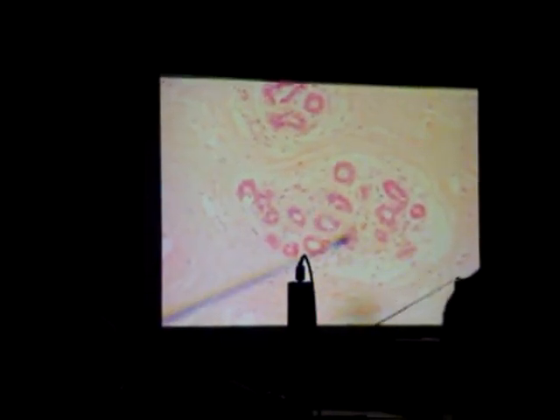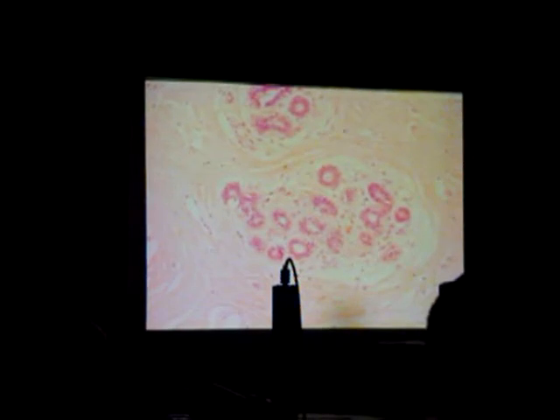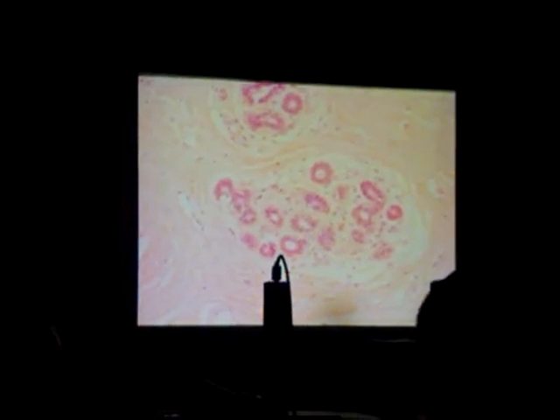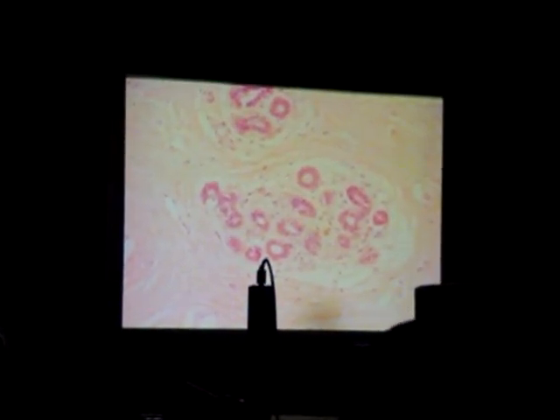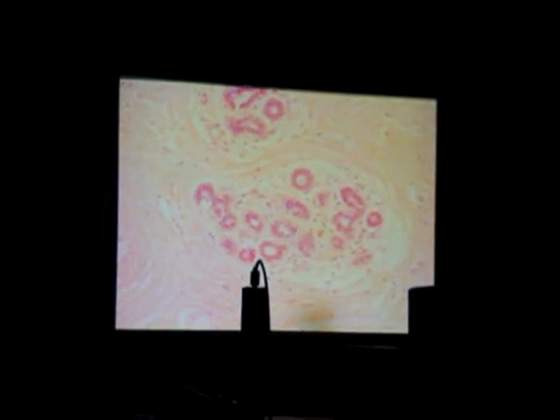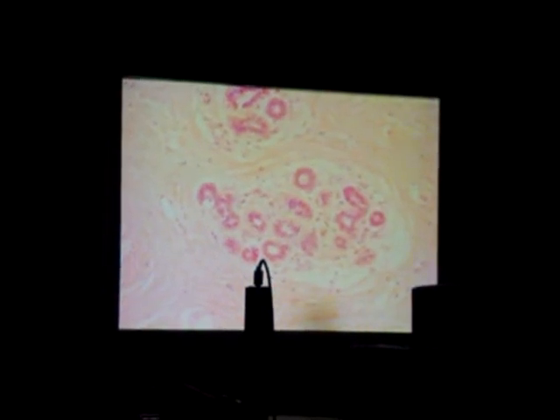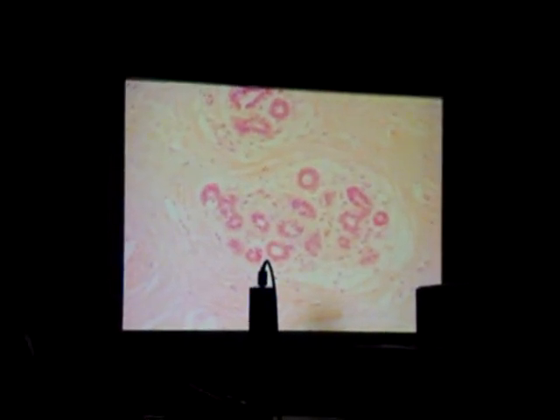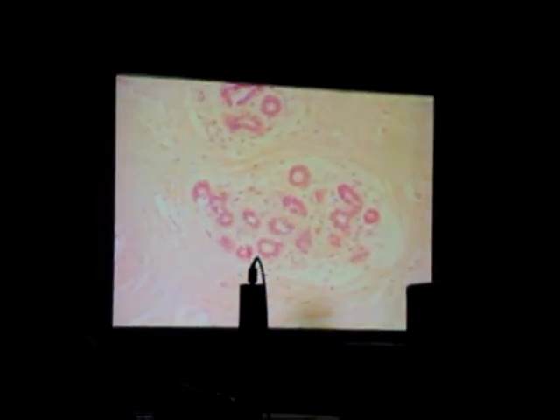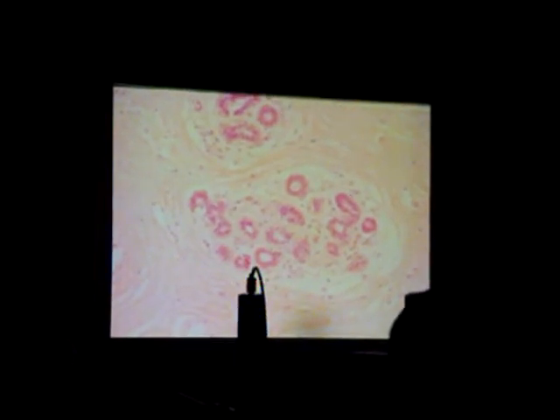That's called the secretory tubule. And name the organ it came from — mammary gland. A possible question is to name the phase it's in. That's the inactive, what we call inactive, meaning non-lactating mammary gland.